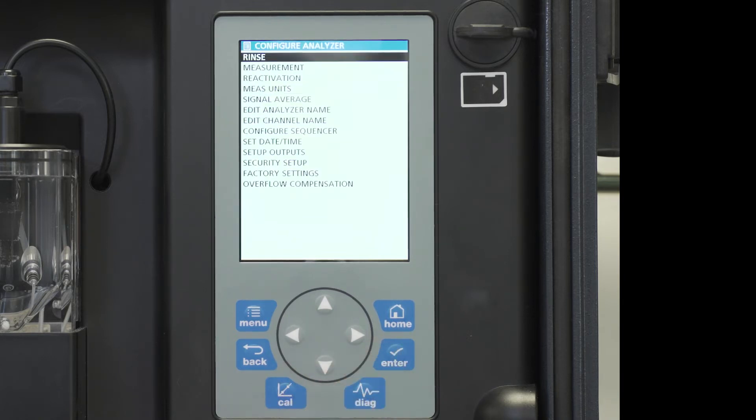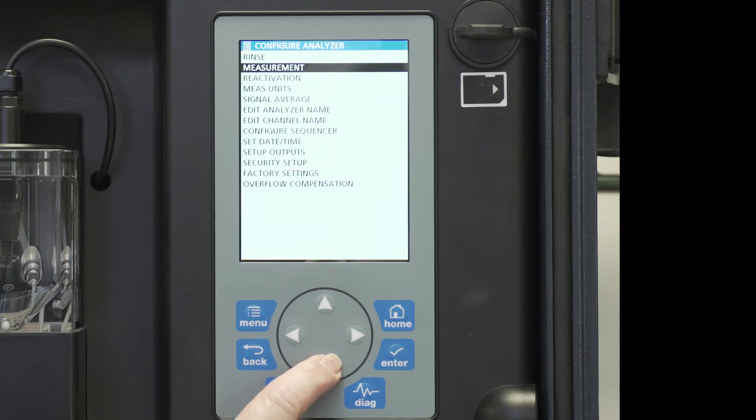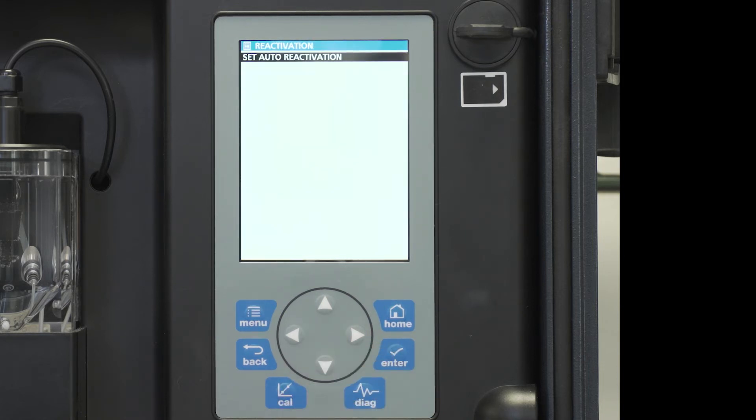Scroll down to reactivation. We'll press enter on set auto reactivation.